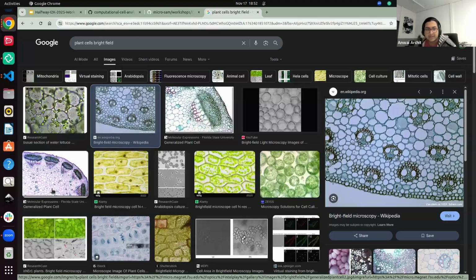Oh, even better, confocal. Cool. So for confocal, the problem always is the resolution in this case. Now that I think about this, for confocal, I would opt for semantic segmentation, which means that all the mitochondria will be segmented in one cell, for example.